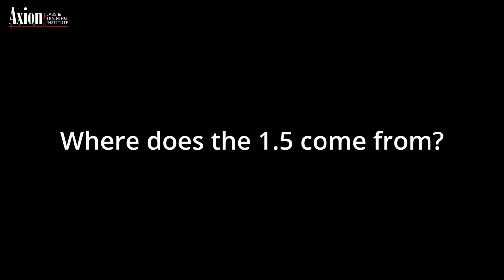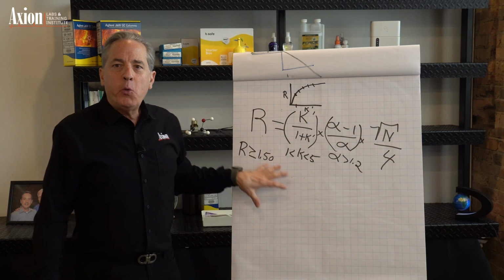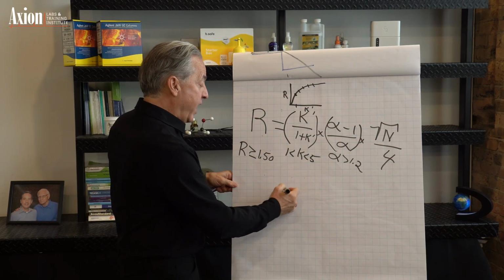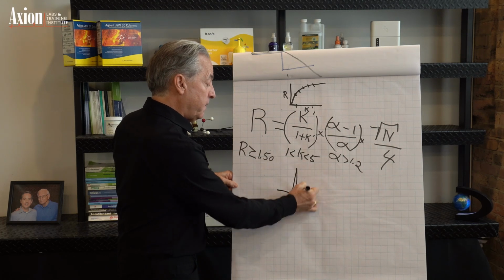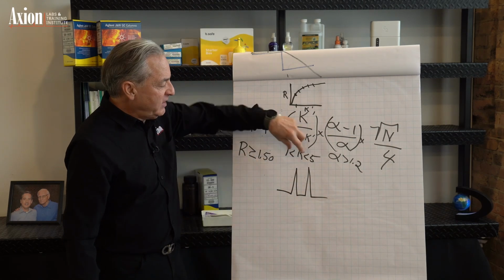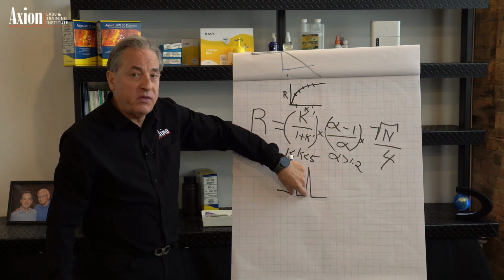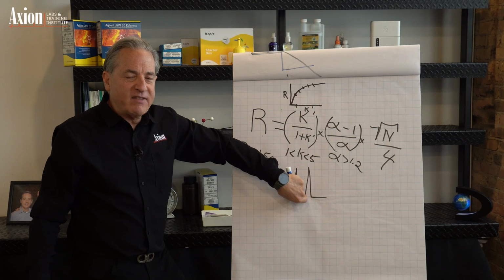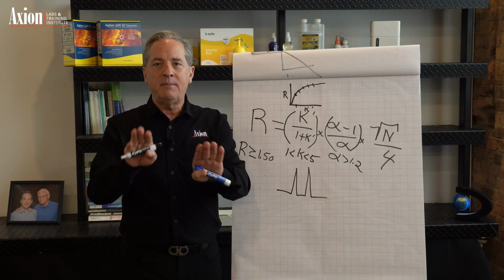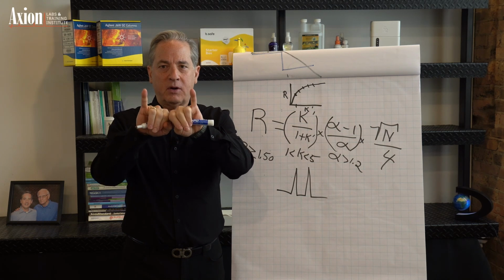We have the master resolution equation, this thing. We also have what's called the graphical resolution equation. So graphical resolution means, okay, I've got two peaks. Are they separated? Is there baseline in between them? So it has to do with how far apart the peaks are at the top versus how broad they are at the bottom. So if I say I've got two peaks a minute apart, is it good or bad? Well, if the peaks are 5 minutes wide, a minute apart, no, that's bad. If they're 10 seconds wide, a minute apart, that's good.